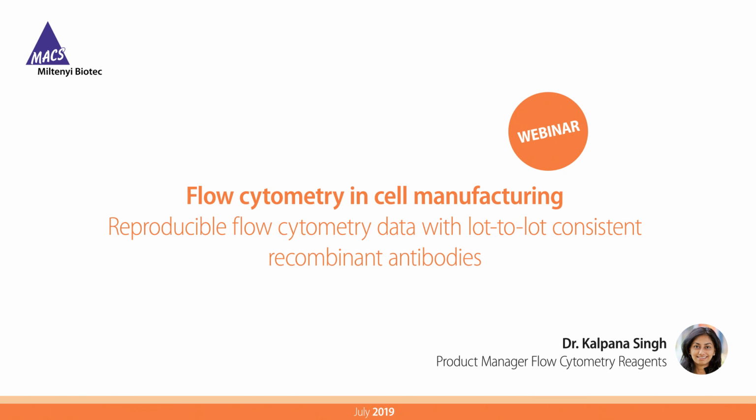The focus of today's webinar is how one can achieve higher standardization and reproducibility in flow cytometric analysis with the use of recombinant reagents, especially in the context of cell manufacturing.